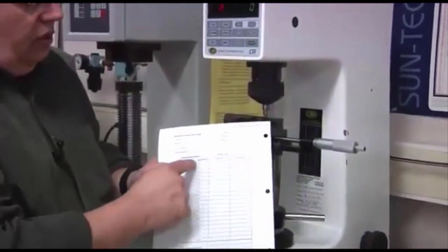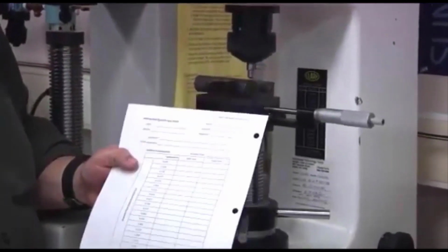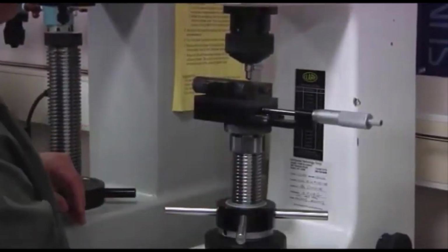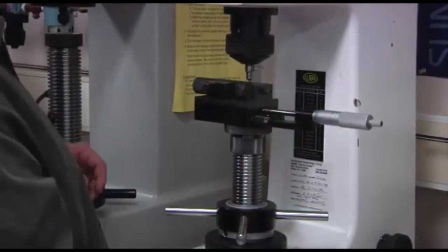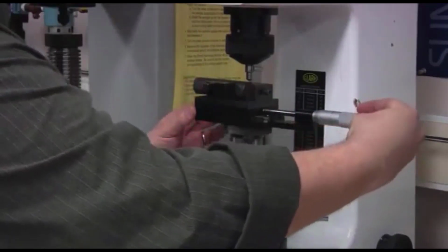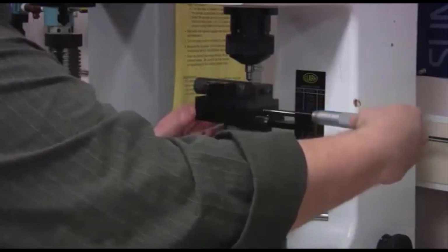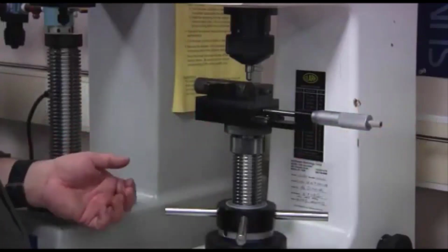So on our data sheet, we're just going to follow the list of locations printed on the data sheet. They're in multiples of 25 thousandths, again, 1 complete revolution of the micrometer. So our first measurement is at 50 thousandths. So that is 1, 2 revolutions of the bar.